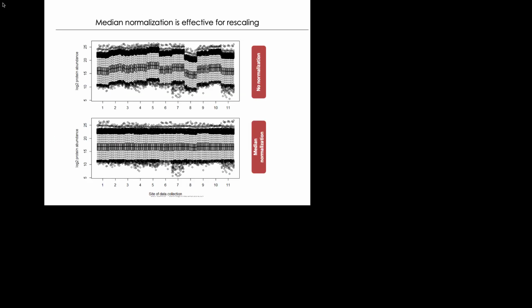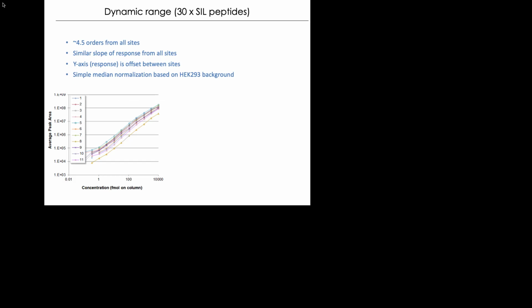Okay, so I think I skip this. I come to the quantification. Here we said that the overall protein identification rate, or the number of proteins and the type of proteins identified, was quite consistent. So we can say, from the identification point of view, the method is reproducible across laboratories. And now we wanted to talk about quantification.